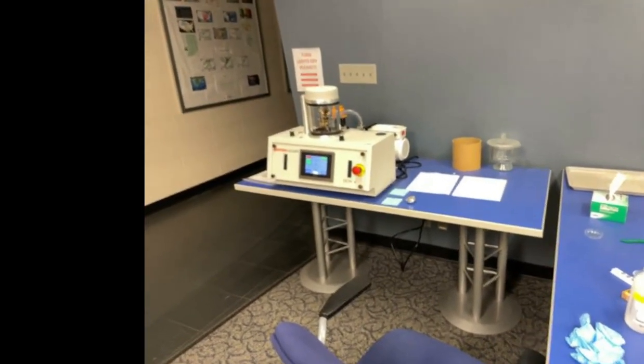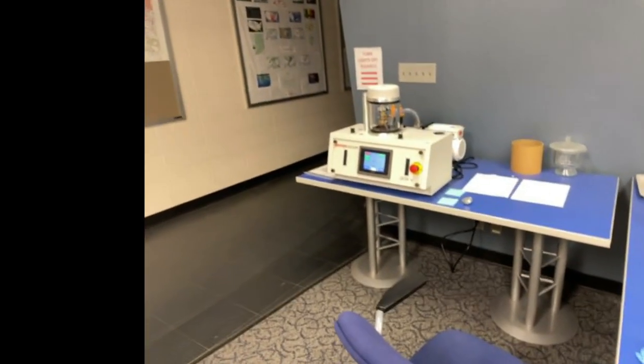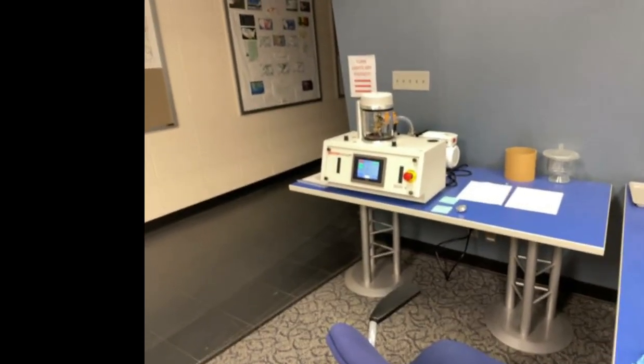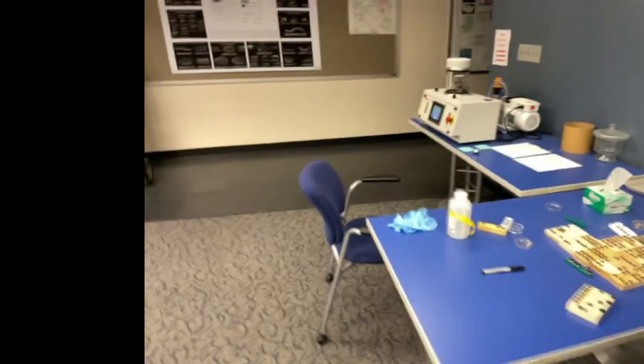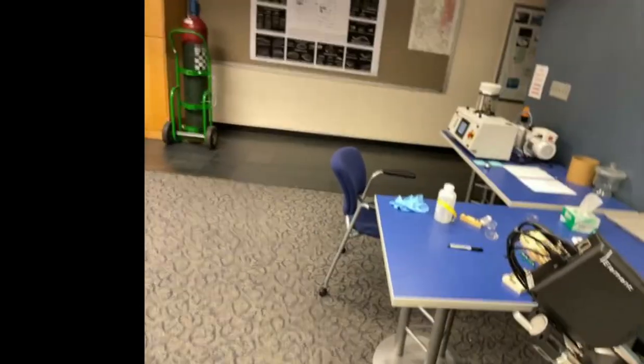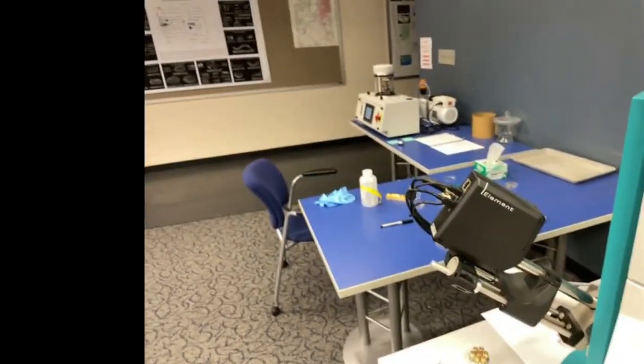So this sputter coating process only takes about a minute and a half or so. Most of the time we're just hanging around waiting, but then it'll be coated in gold.